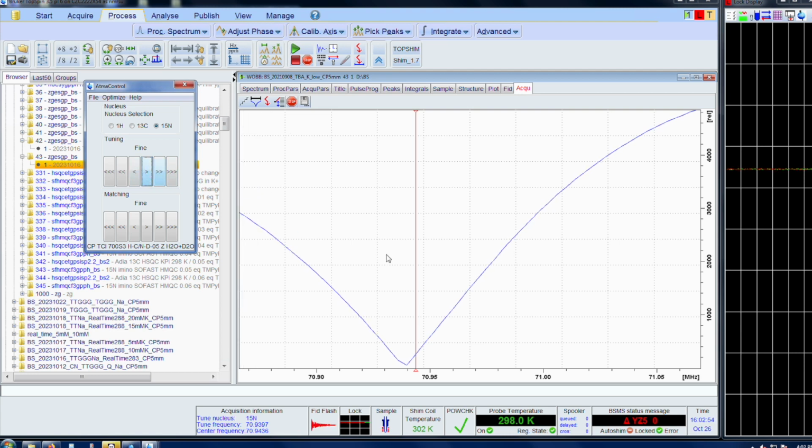One has to wait a few seconds after clicking, because all we are doing is changing some values in the software, but that ends up changing currents in different coils or actually makes a mechanical movement. So do not click frantically, do it slowly and step by step.